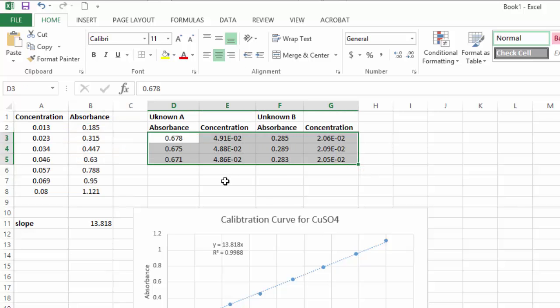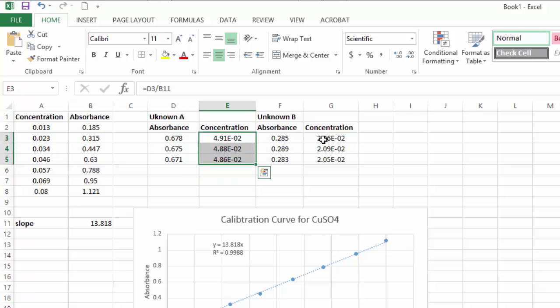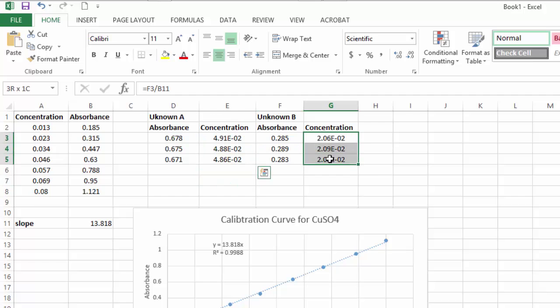If I want to make these look a little neater, I can highlight them and center them, and do the same for the other column. So these are the concentrations of my unknowns.